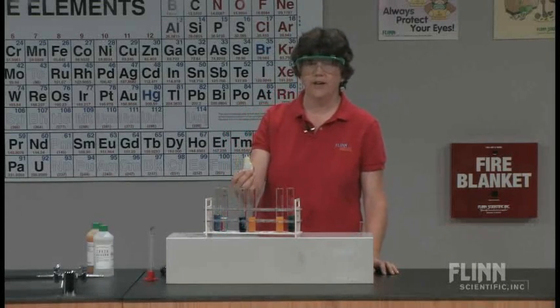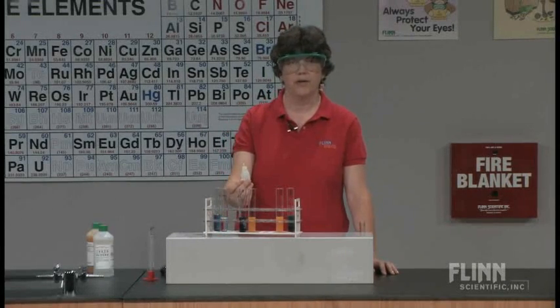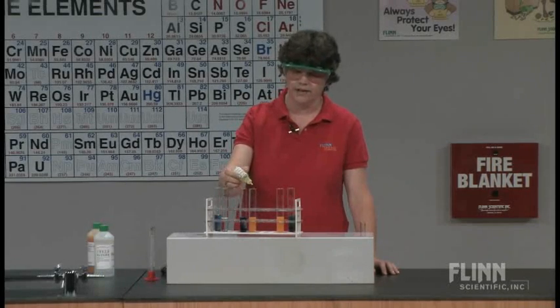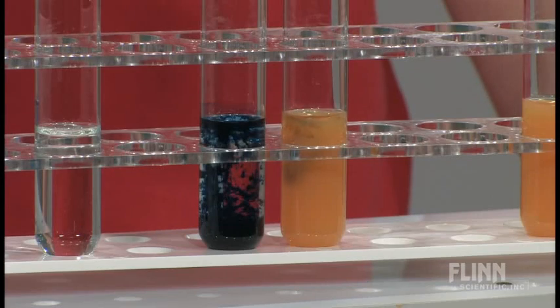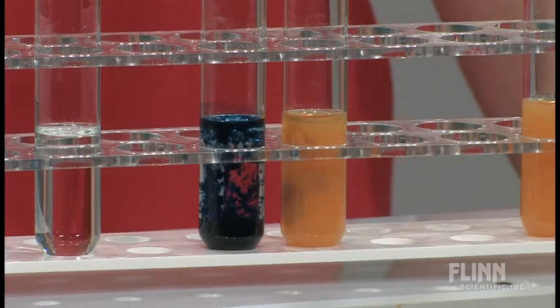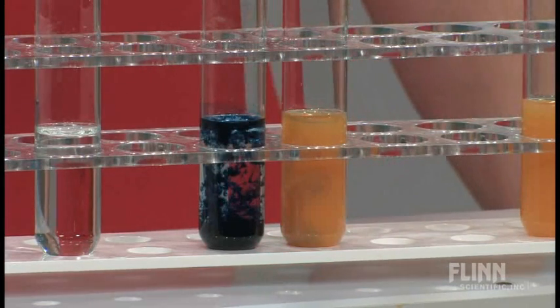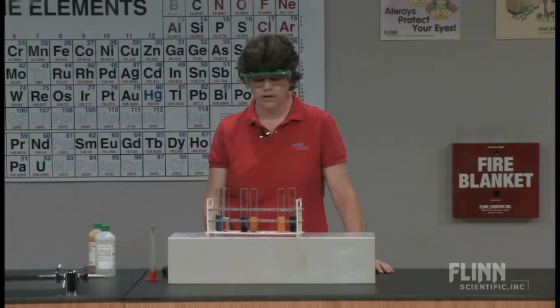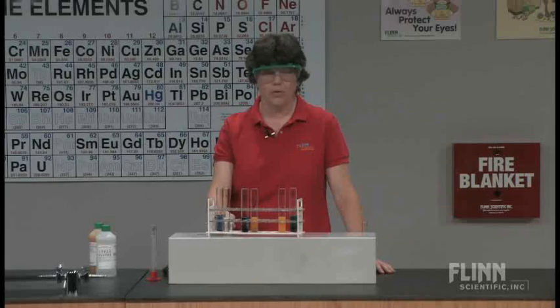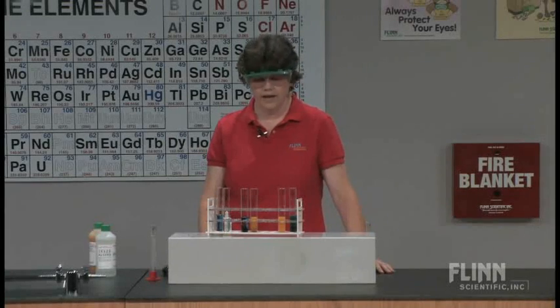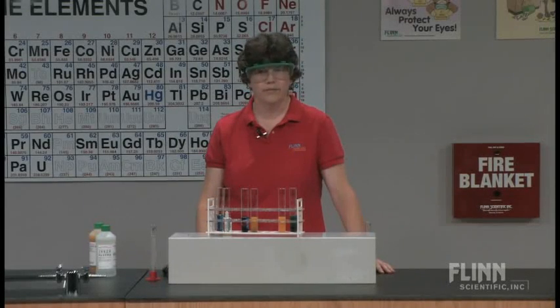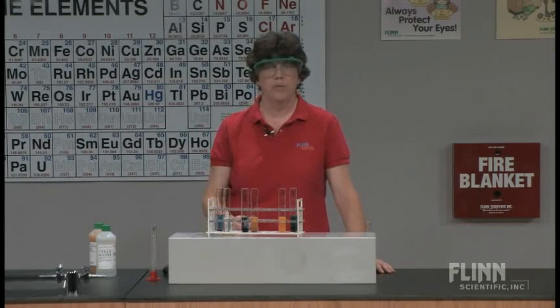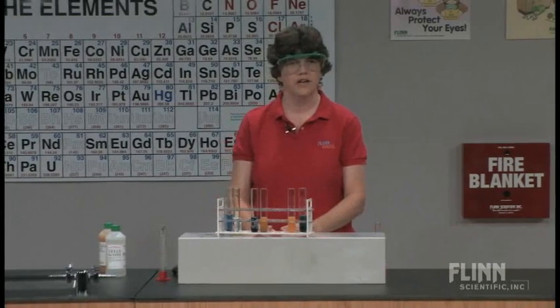But what happens if I add the ferricyanide, which is the three plus oxidation state, to the test tube that already has iron three plus in it? No color change. Maybe a little bit of blue. There might be a little bit of the two plus in there. But essentially we get no color change because we don't have that hexacyanide complex ion in the solution. So the Prussian blue is going to be when both iron oxidation states are present.